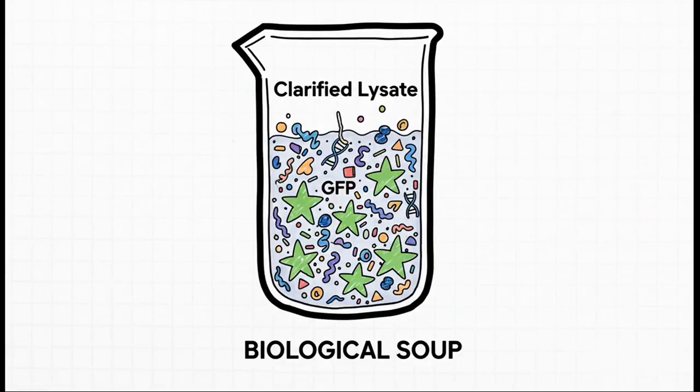So after all that separating, washing, and breaking, what do we actually have? We have a liquid called clarified lysate. But here's the thing, it's not pure GFP, not even close. It's more like a biological soup. It's got our target protein in there, but it also has a whole mess of other stuff from inside the cell. Other proteins, DNA, you name it.